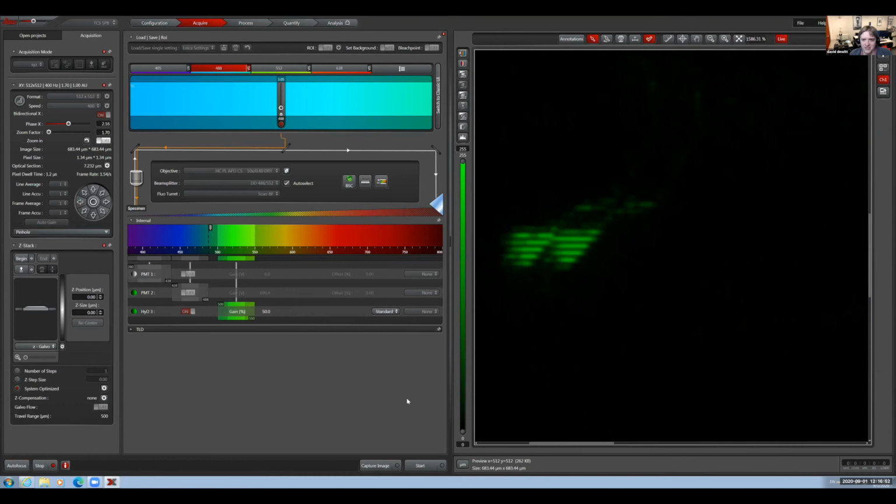you'll actually see the image separate, where you can see lines that are read from left to right and right to left are not overlaying properly if the phase is off. Whereas if you adjust the phase to where it's perfect, you won't see any of that zigzag at all. Okay, so does it know where to make it perfect?